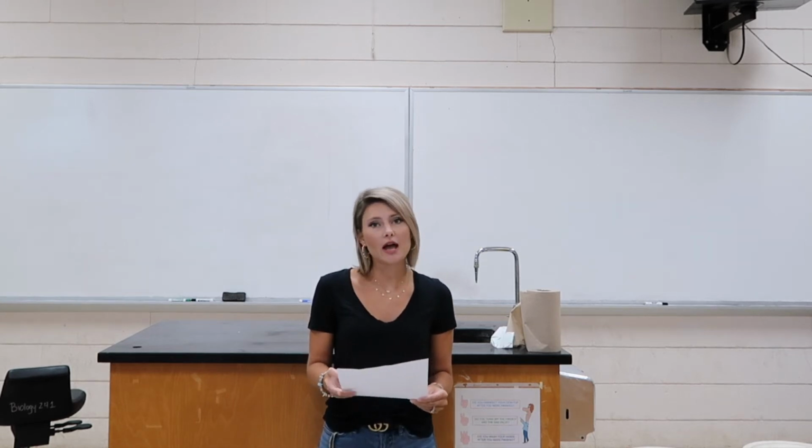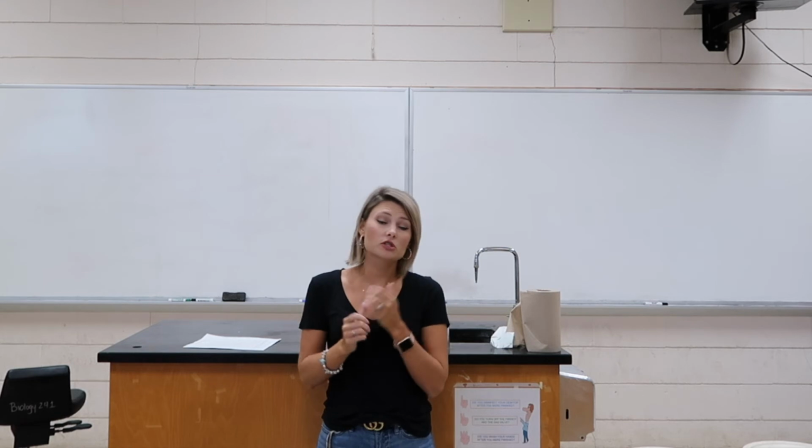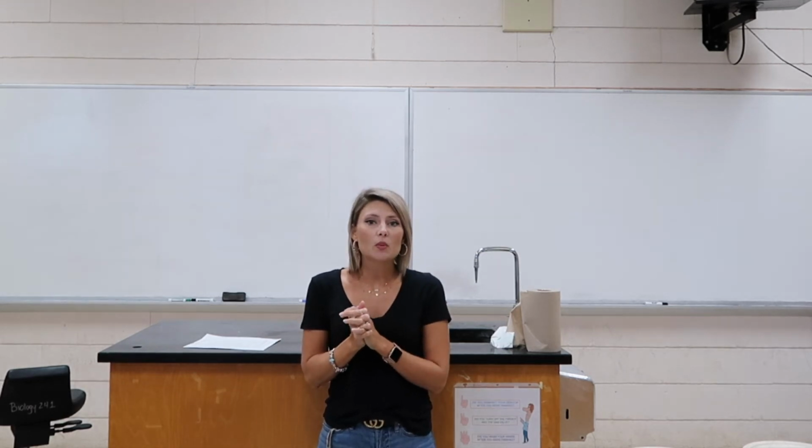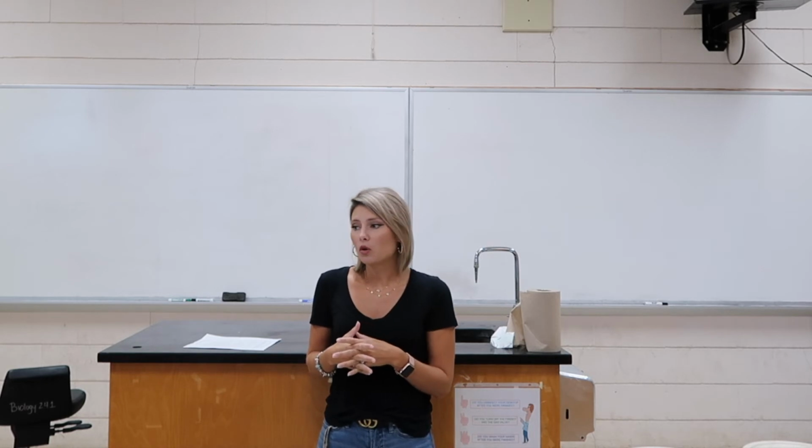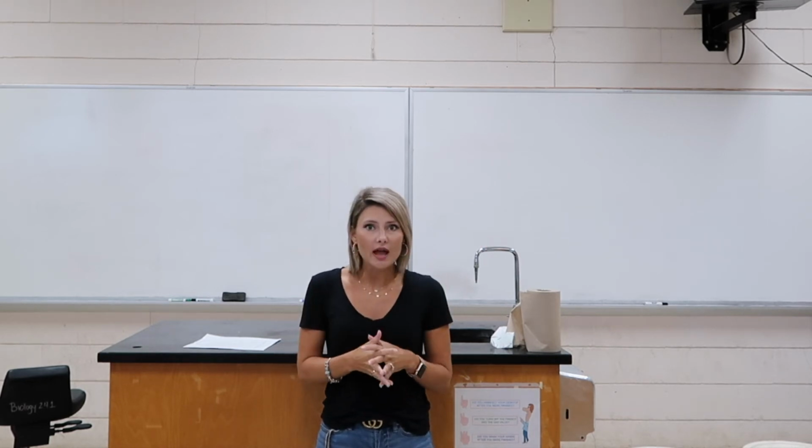And then 21, describe how to clean your workstation before and after your lab session. Now, this is going to be a little bit different than years past or semesters past. So we've added some disinfecting techniques because of COVID. We don't want it to be spread around in our lab.